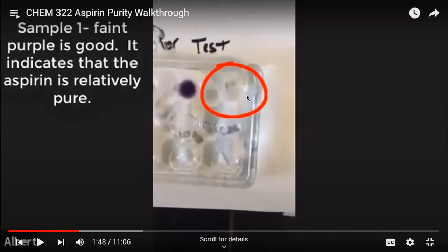So where it says on the data sheet, if you're using sample 1, where it says within limits, you can put yes. Right, there's a limit, I think it's 0.15%, of how much salicylic acid the pure aspirin can contain. So where it says within limits, you can say yes. And then where it asks for the color, if you're using sample 1, you can just say very faint purple. Right. All right. Questions about that? Any questions?